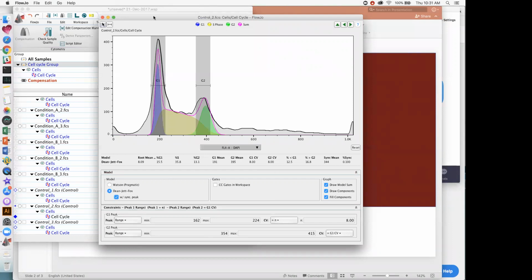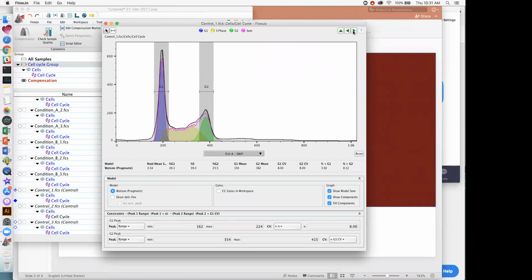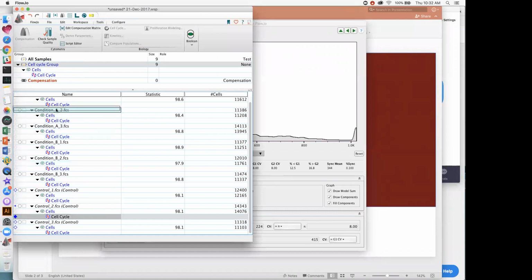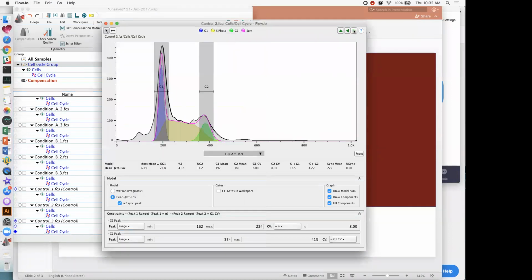Okay, and then from here, once you've visualized the different application of the models across all the other samples, again, it's a matter of personal taste which one you want. Just pick a model and stick to it, right? In my case, again, I changed the model, but I did not apply it to the rest of the samples. I'm kind of curious how it applies to some of those that are kind of erratic with their distribution.